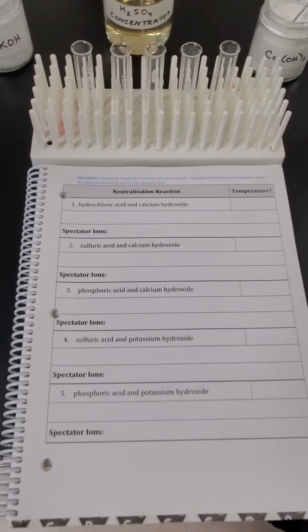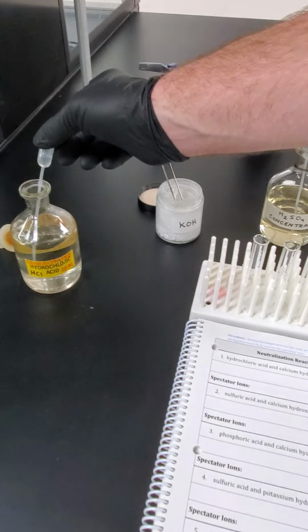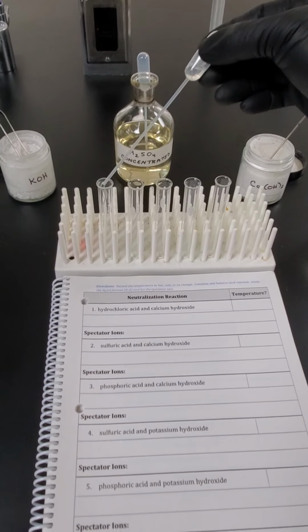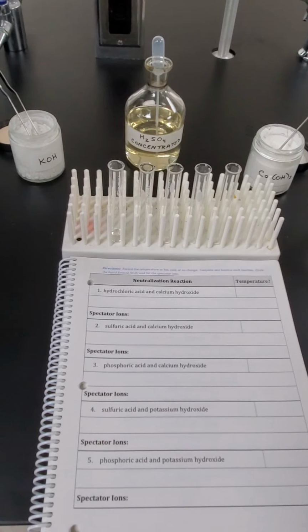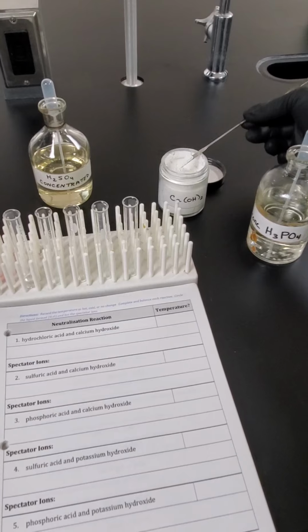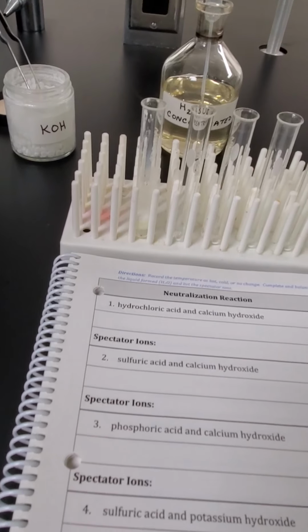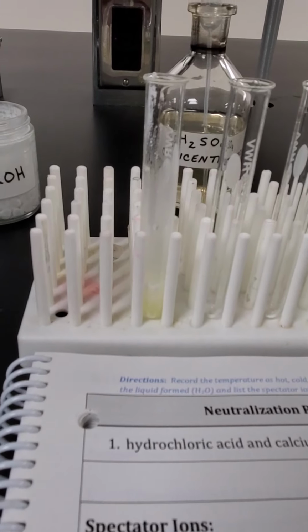All right, so we're back for our last page. We need some hydrochloric acid and some calcium hydroxide. So we're going to take this very nasty eat-cement hydrochloric acid and put it in the first tube. And then to that, we're going to add calcium hydroxide, which is this white dust. And in we go. So very hot.